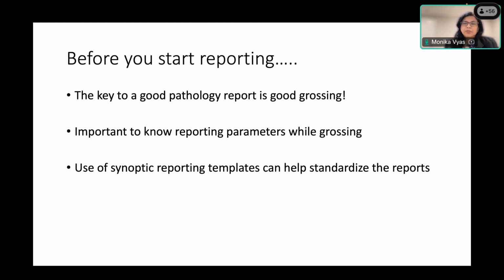If a pre-operative biopsy is available, they should go over the report and see what type of malignancy was reported, and then go over the reporting parameters, because if they submit appropriate sections while grossing, it becomes very easy for the pathologist or the trainee evaluating the slides to understand what the prosector is trying to demonstrate. Also take good quality pictures for people to go back to. Once the specimen is grossed, you cannot put it back together.